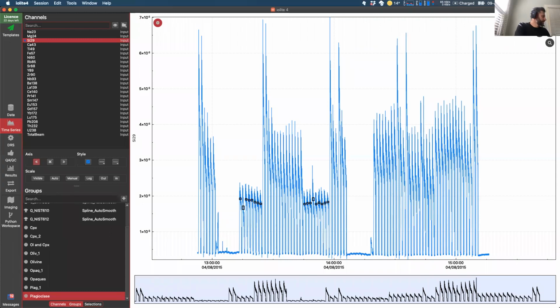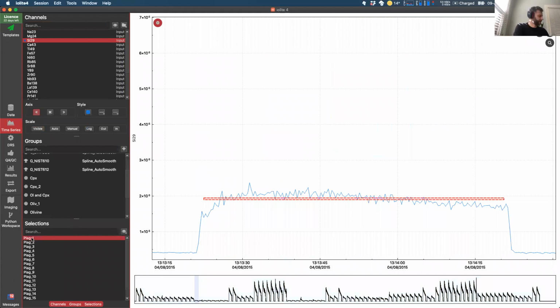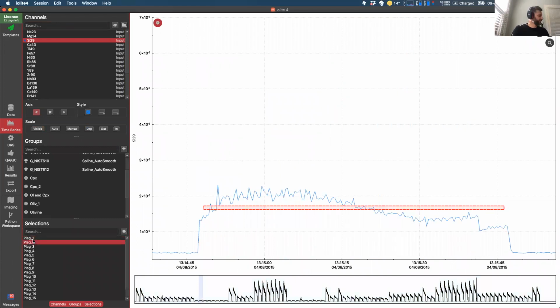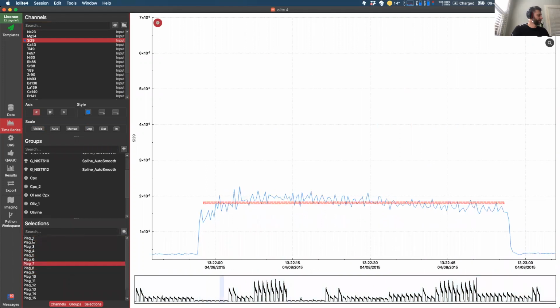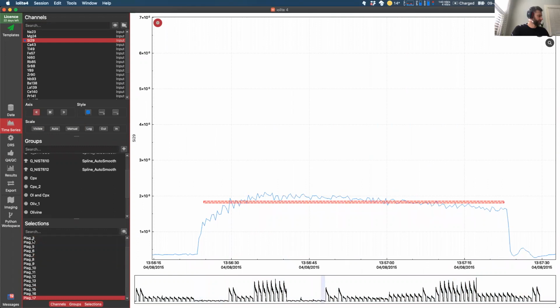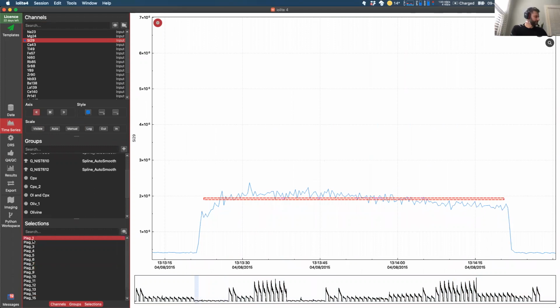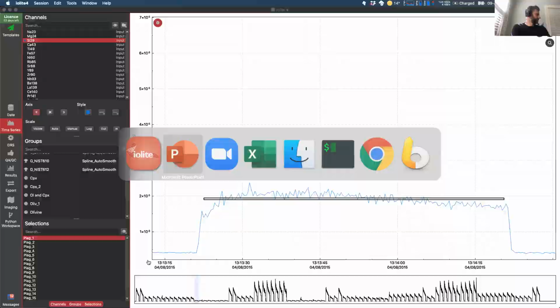So this is now where we can show the selections button down here. If we click on this button, it will show the selections part. And this will show each of the selections that you've made in the list. If you click on those, it'll go straight to that selection. You can actually use the arrow keys to move up and down through these so that you can go through your selections very quickly. If you're looking for spikes or drill through, then this is a really good way to examine your selections. So that's looking at selections in time view.